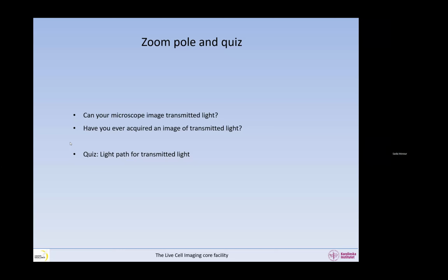Yes. Okay, we do have something. It's actually very common. Once you know how to do it, first of all it's very easy, especially on a point confocal, because you already use the lasers. All you need to do is turn on the detector, so you don't add any light. So we're going to do that, and then you will know. Well, thank you, attendees.